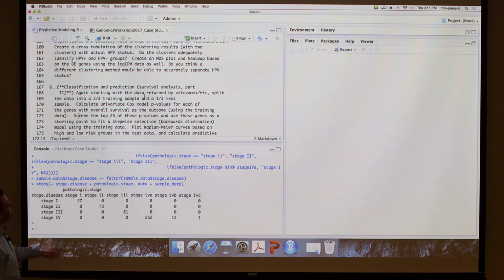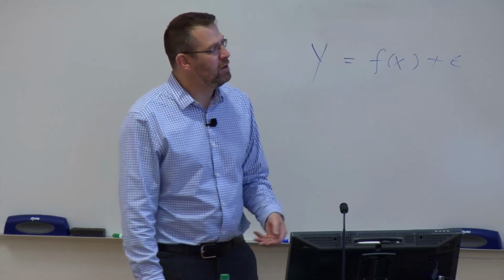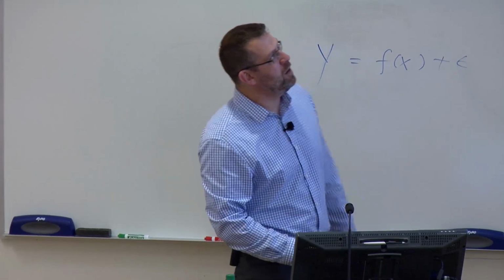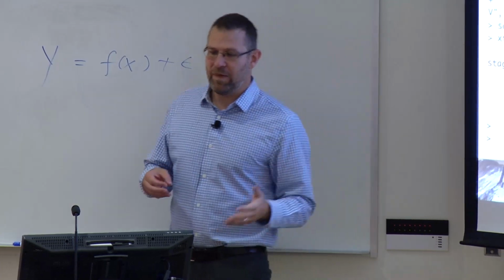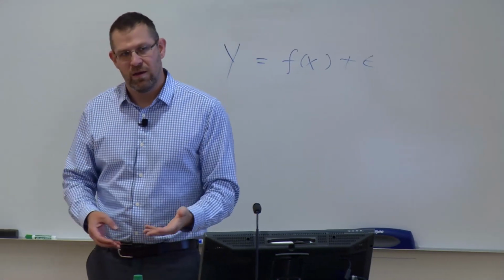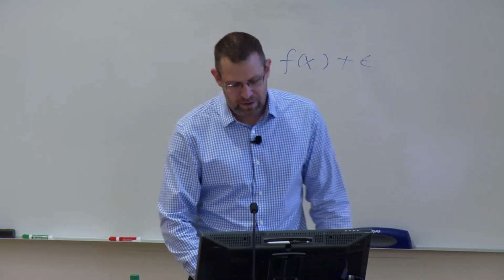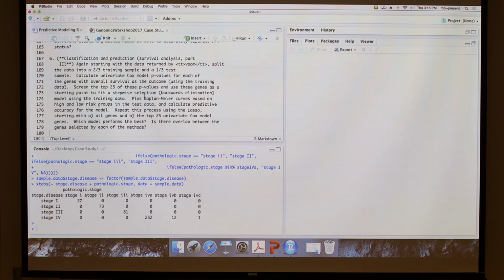And again, there should be code for this from what Dr. Lambo discussed in his presentation. All these questions are going to take from parts of the workshop, so the idea is, I learned about this, now I'm going to go grab that code. Can I execute this code on a totally new and independent set of data? That's the goal. And at the end of this survival analysis, see what model is the best by looking at predictive ability, in other words, C indexes. Okay, I'm going to stop there.